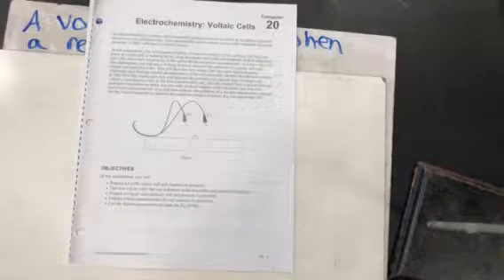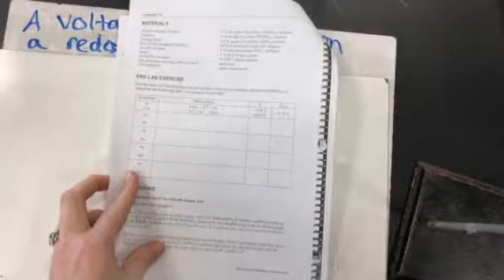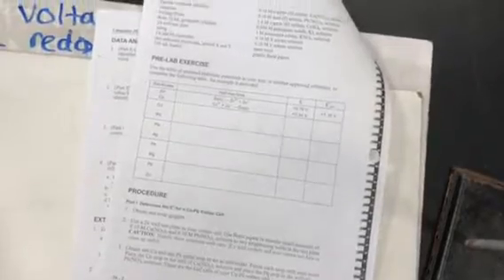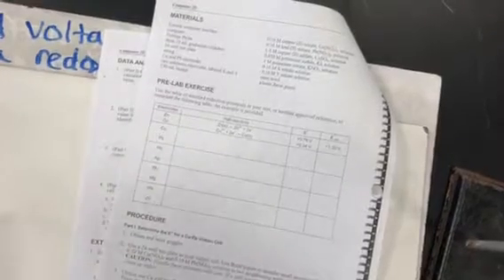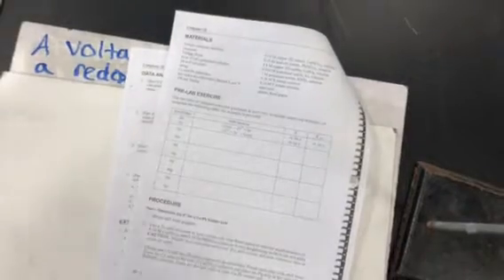Right now I'm going to be explaining a couple of the different methods for this specific lab, the advanced chemistry with Vernier pre-lab questions we're dealing with, on why these specific values are recorded as positive. First of all, we just jumped right in and I didn't give you very much time to read over the introduction here.